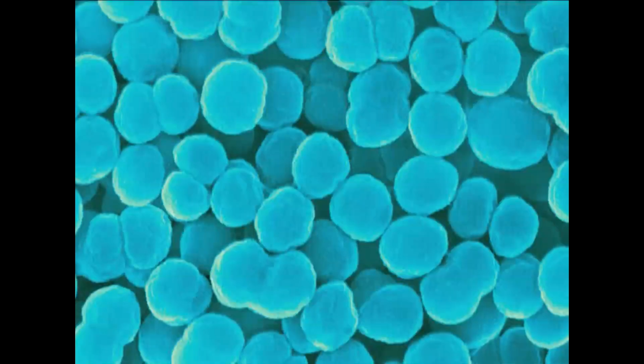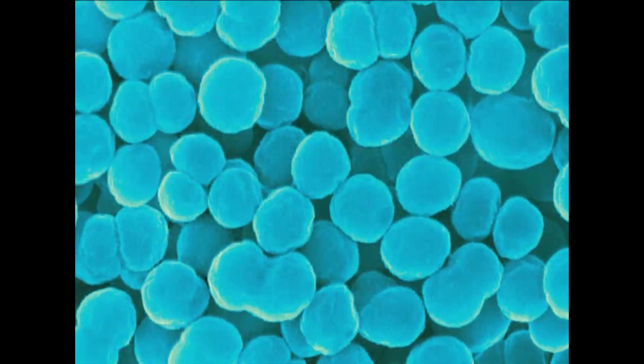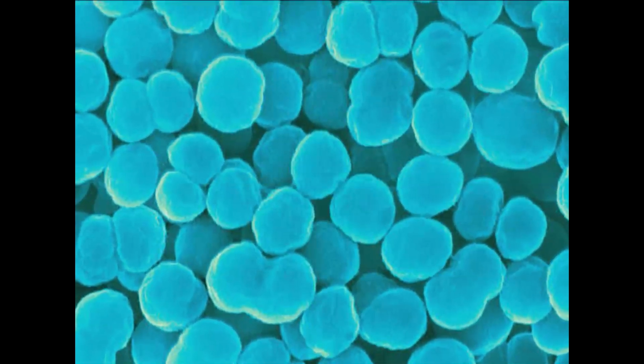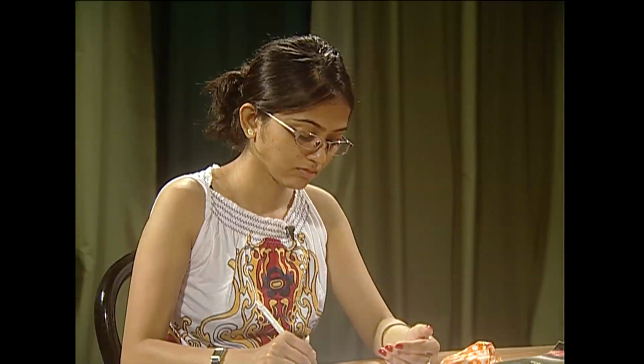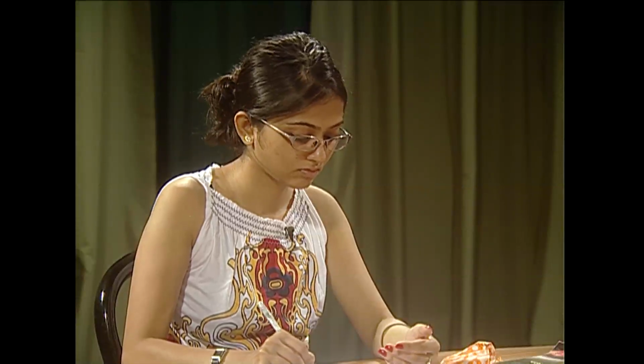Moreover, this heat generates an arid environment which leads to internal burning of the cells or microbes. Dry heat sterilization needs a temperature of 160 degrees centigrade, and a duration of 2 hours is supposed to be enough to get rid of endospores.